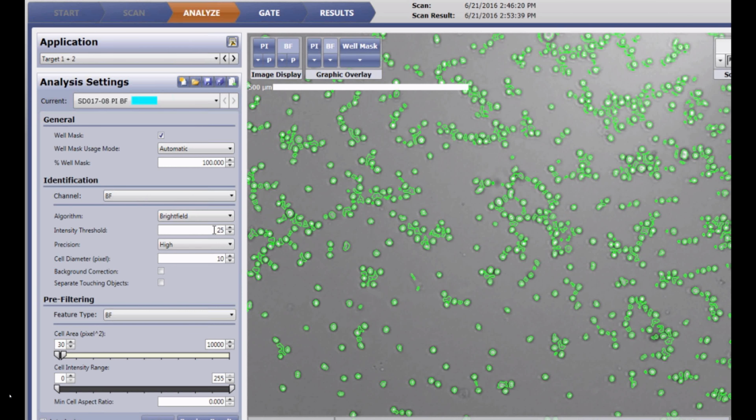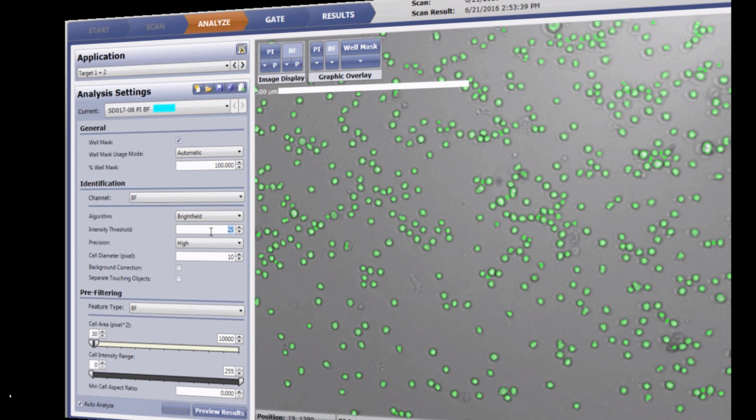And if you wanted to record these values to try it out right off the bat on your cell lines, you can do that, because I would say typically this is what my suspension cells will always look like, and then the adherent cells you saw, those usually are what I'm seeing as well.